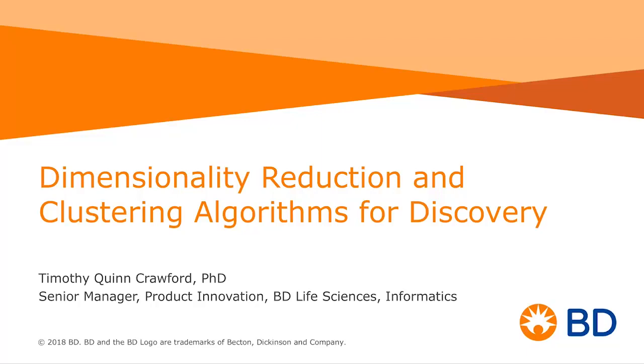I'm going to talk about dimensionality reduction techniques as well, and how we can merge those tools together in a workflow that will allow you to find complex populations in high parameter data and determine how they change across your experiment. So I'm going to get started by going through a presentation, and then I'll demo the functionality at the end for you.